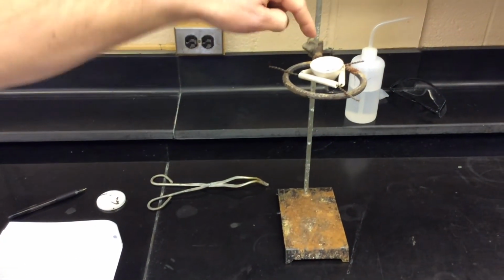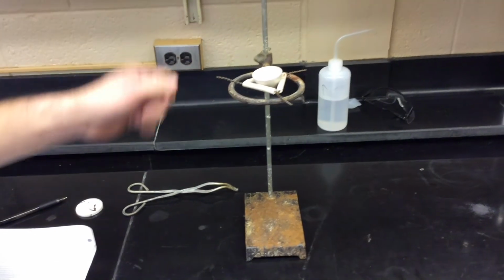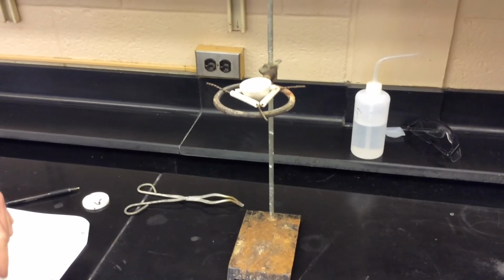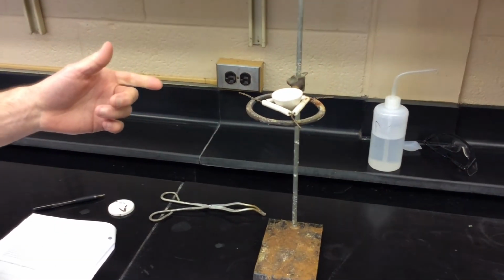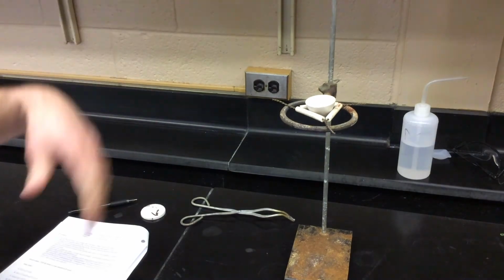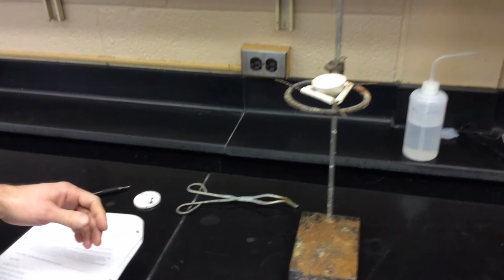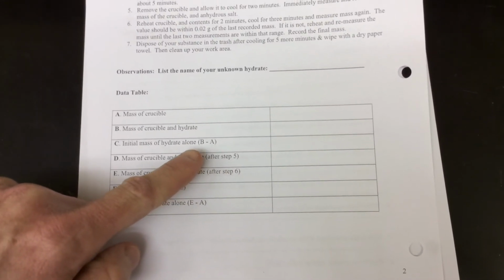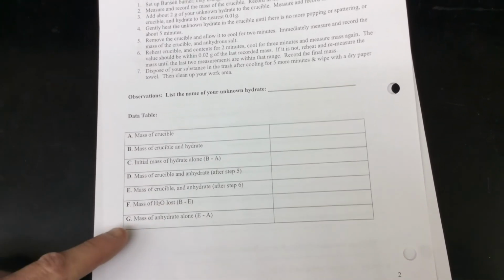What you're going to do is have the barium chloride dihydrate in there and heat it up for a certain amount of time. It tells you in the lab. You're going to get the mass. Then heat it up again for a certain amount of time and get the mass. If the mass doesn't change, it's telling you all the water that was going to evaporate has left. You're going to write all that information down here, and it gives you hints of how to do some calculations, like B minus A. Basically what you're getting down to is the mass of water lost and the mass of the anhydrate alone, the anhydrous salt.